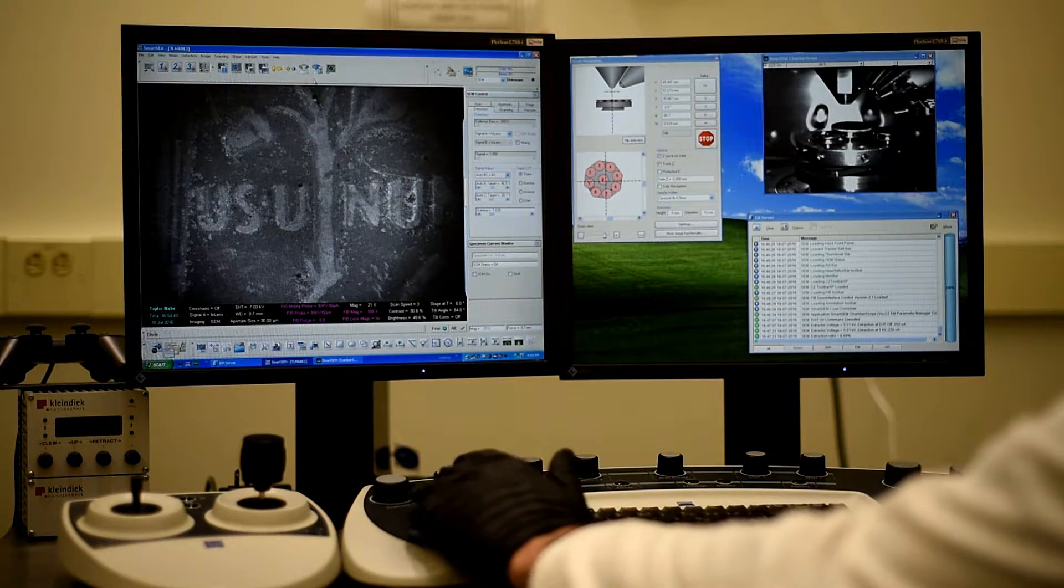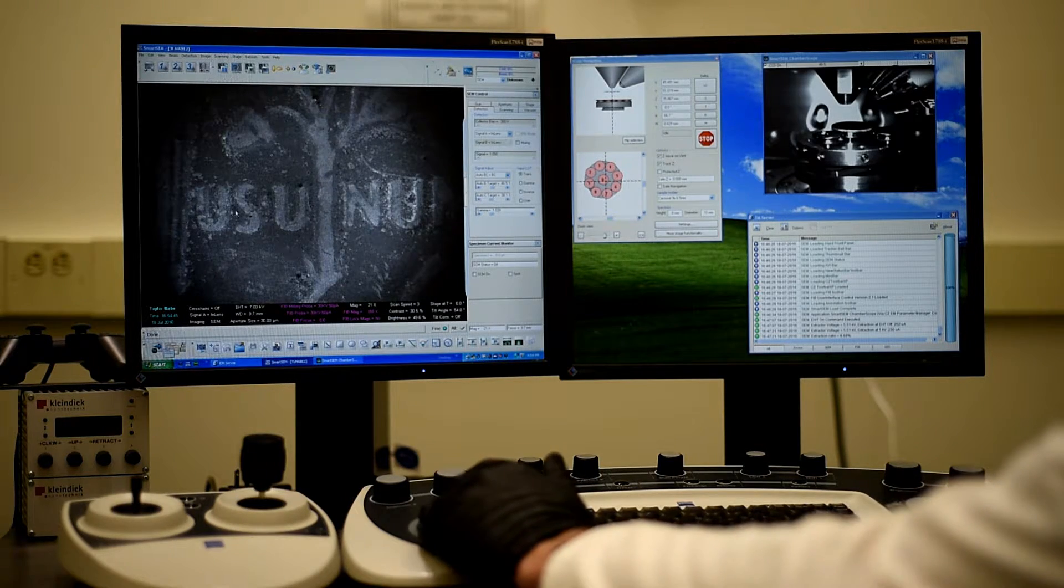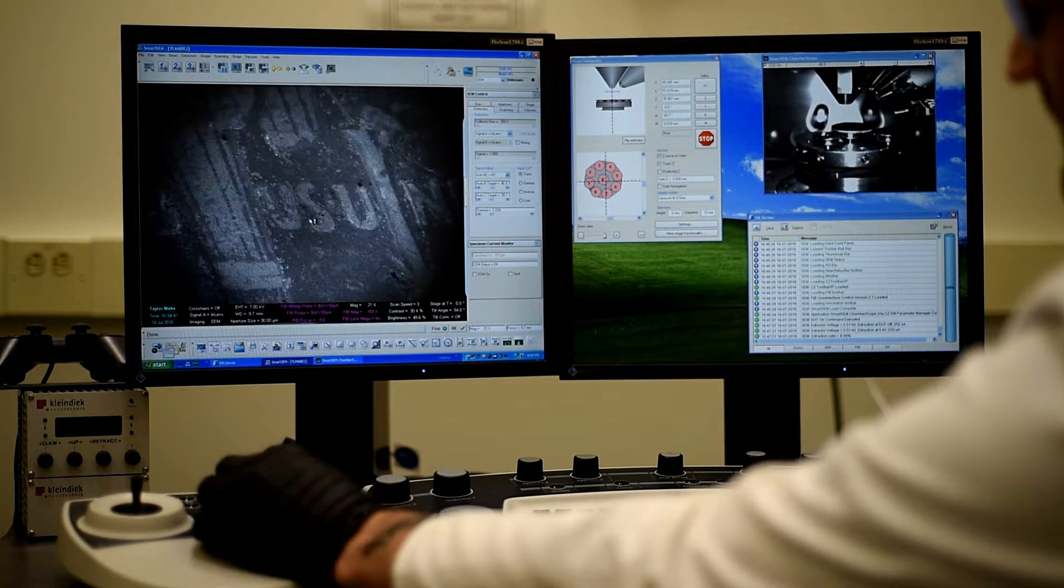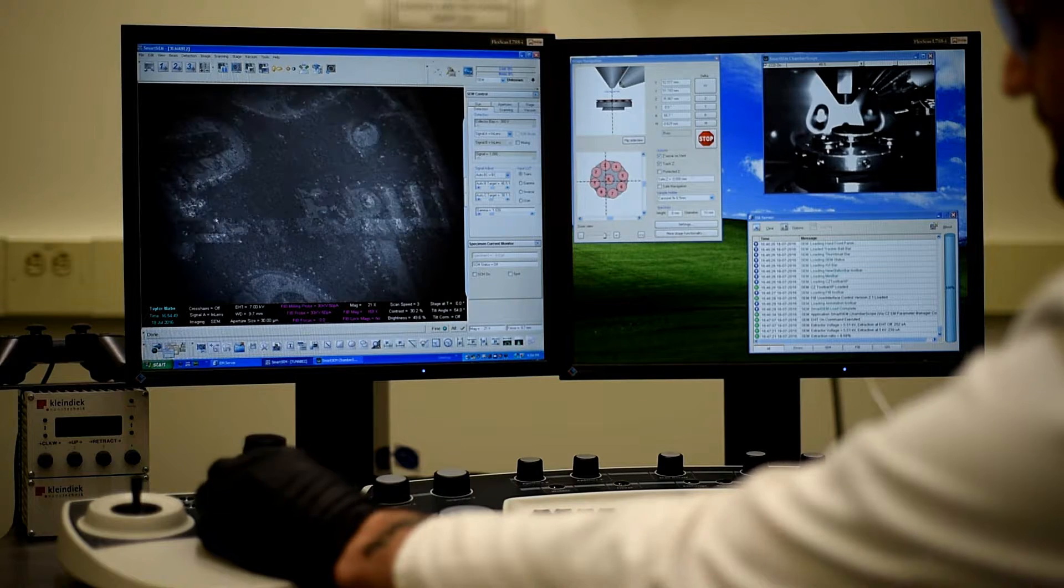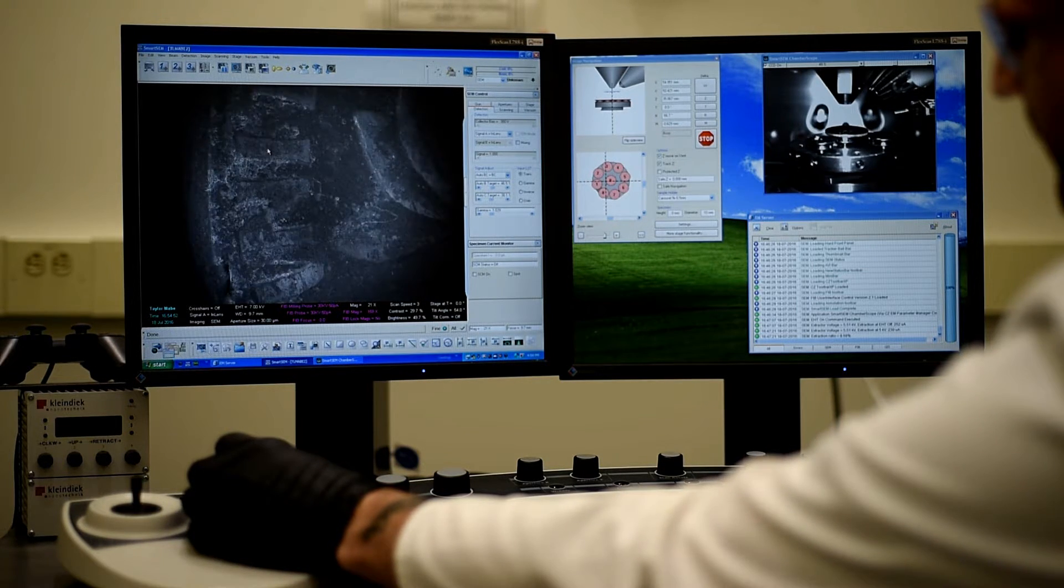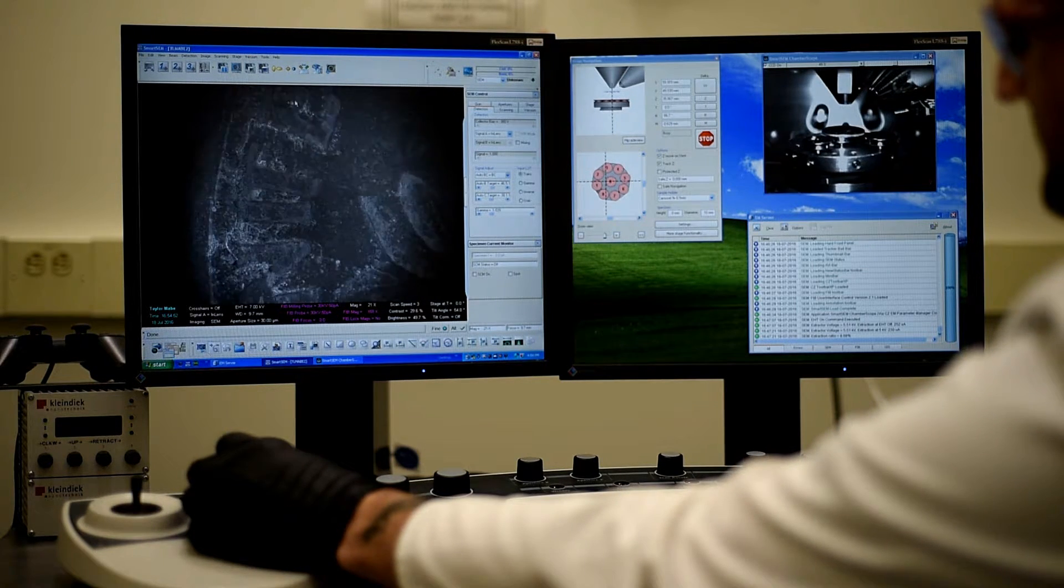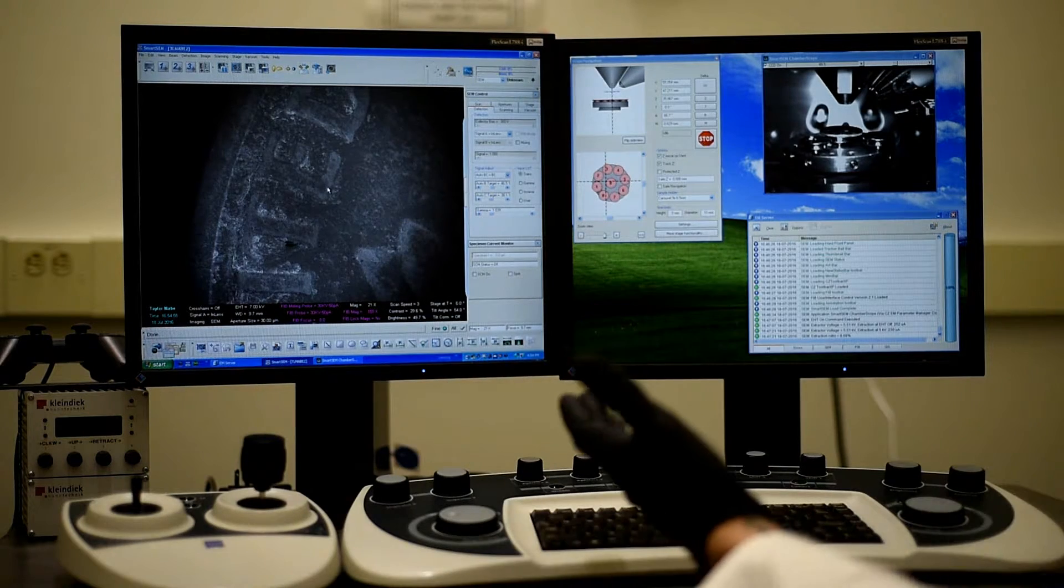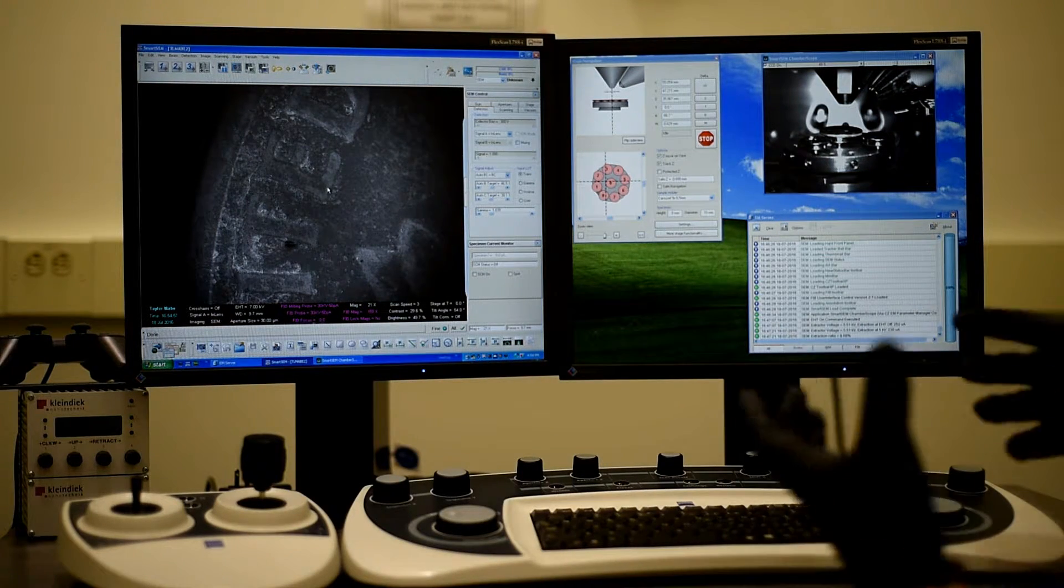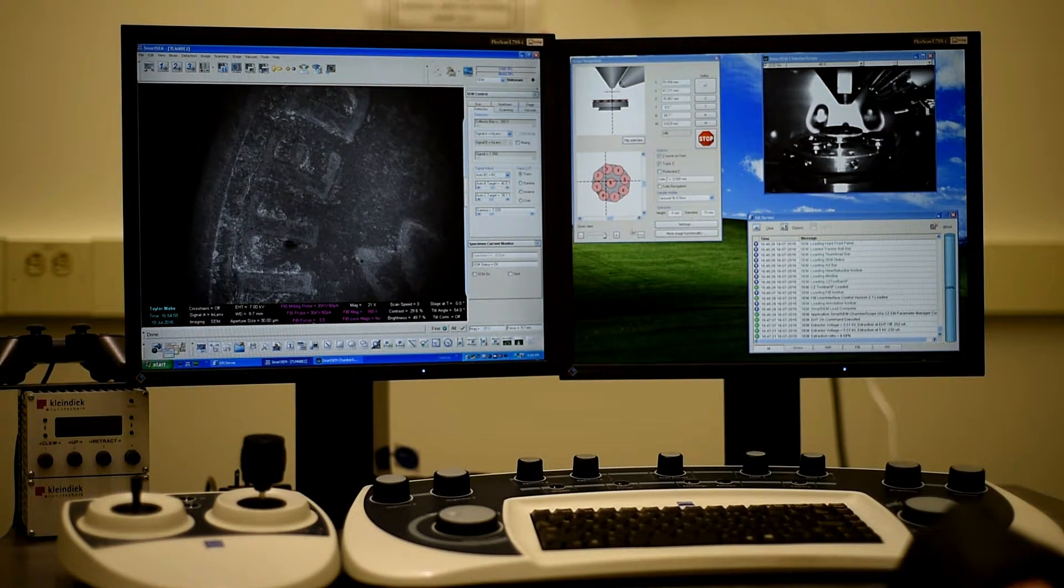So here's the little fig leaf or whatever in some of the Latin that's inscribed on a dime. And here's the part that says United States. So, like I said, the dime is something a lot bigger than what we would normally put.